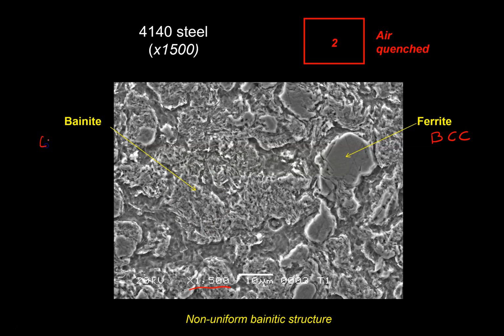And so this represents your bainite. It's also low temperature ferrite. Sorry, not ferrite, pearlite. So low temperature pearlite. So pearlite should form some lamellar structure, but the bainite here doesn't really form this structure. It's a lot more distended, but clearly different from a martensitic structure.